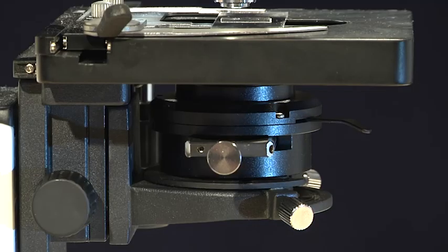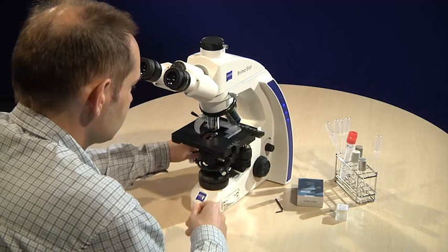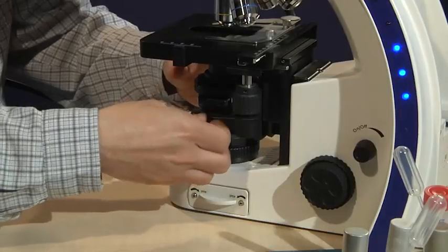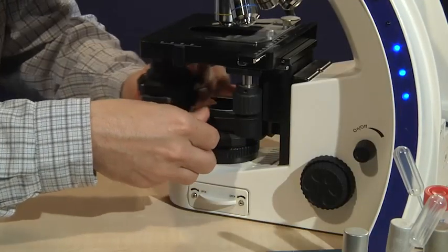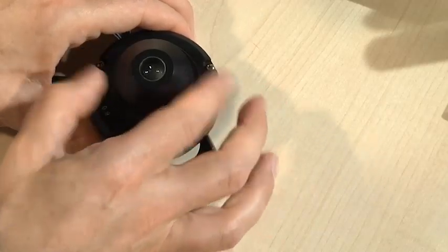The condenser focuses light from the light source and illuminates the specimen with uniform intensity over the entire view field. In addition to the objective, quality and adjustment of the condenser is essential for the optical resolution of the microscope.